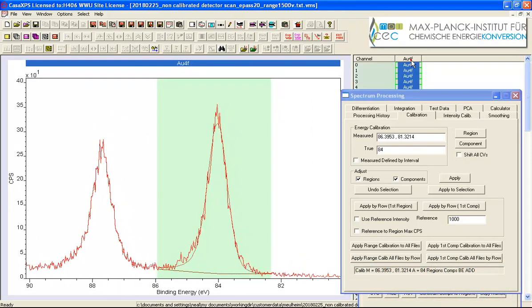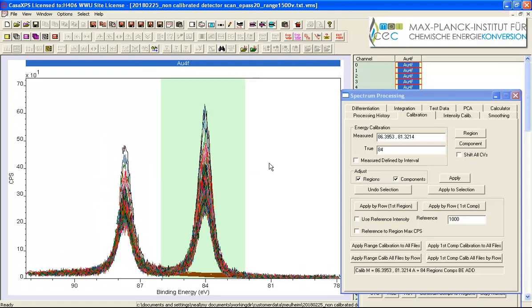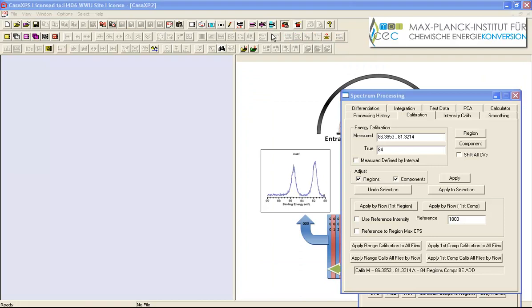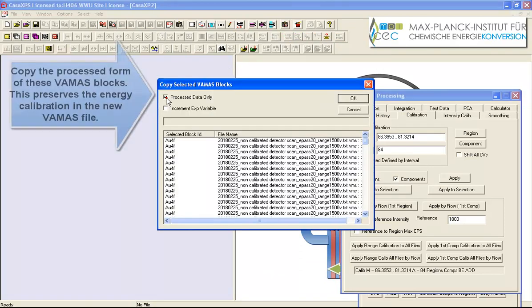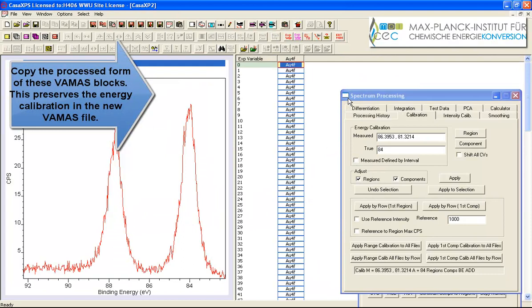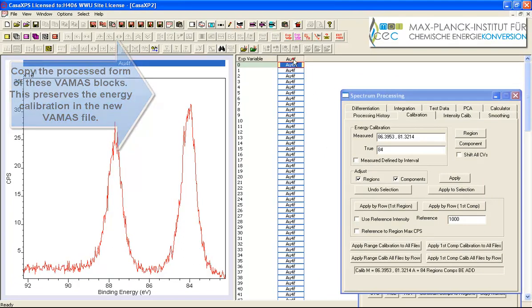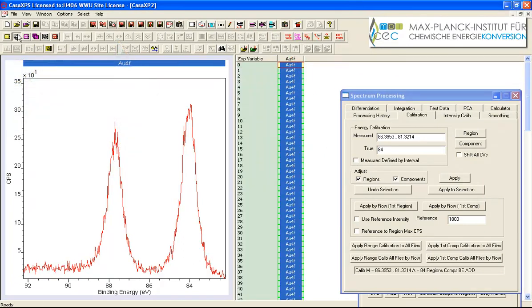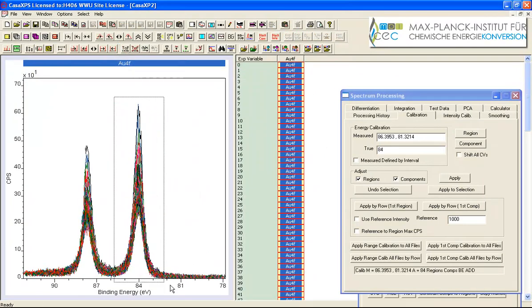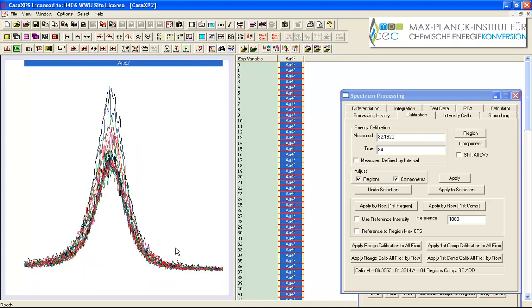So that seems to have worked out quite well so what I'll do is I'm going to copy to a new experiment frame the process data in other words the data that has been calibrated so we now have well aligned peaks here.